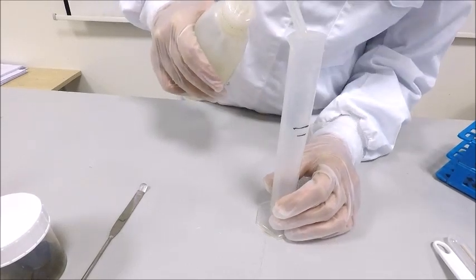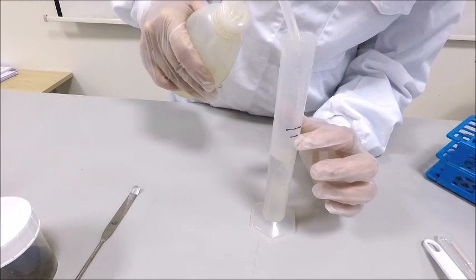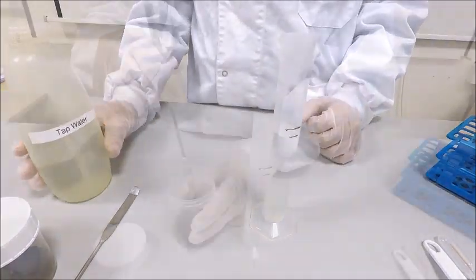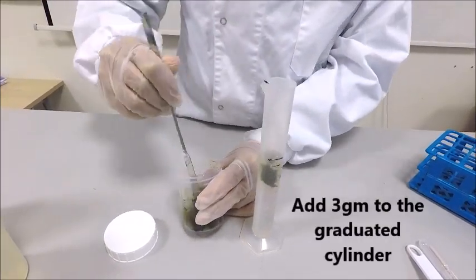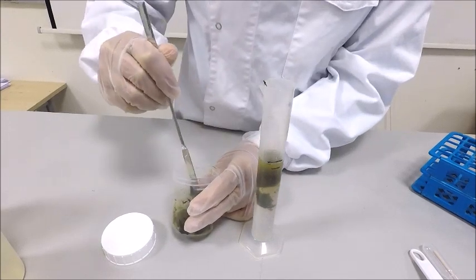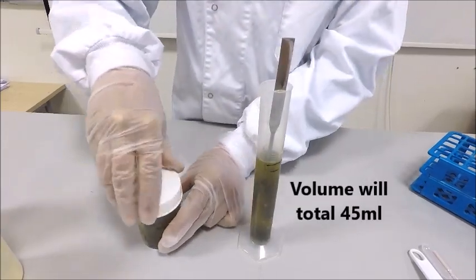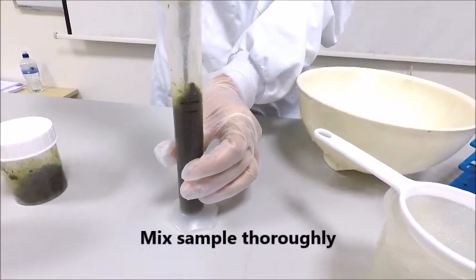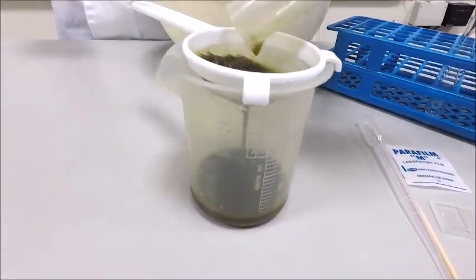Taking your water, add 42mL to your graduated cylinder, to the first mark indicated. Then, taking your fecal sample, make sure it is well mixed and add 3 grams to your cylinder. This will result in a total volume of 45mL. Pour your fecal mixture through your tea strainer, collecting the filtrate in the beaker.